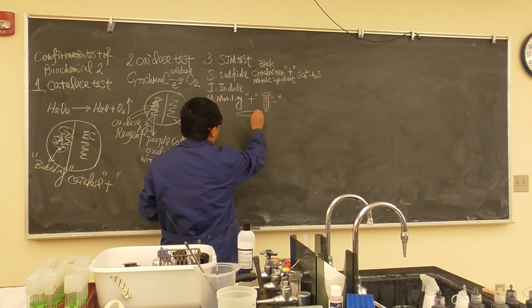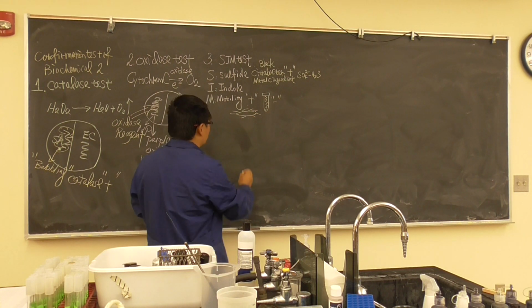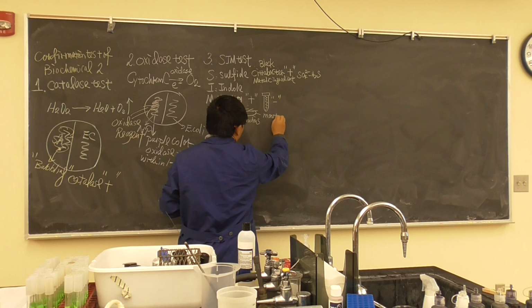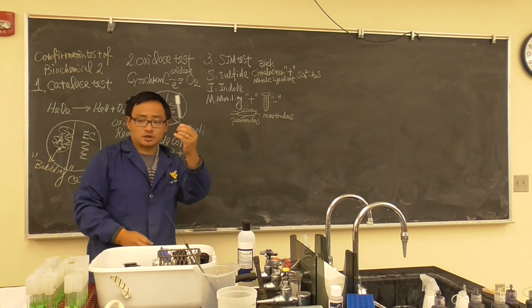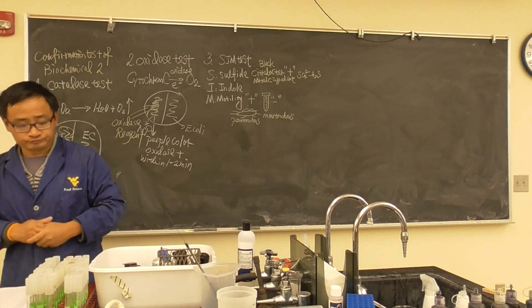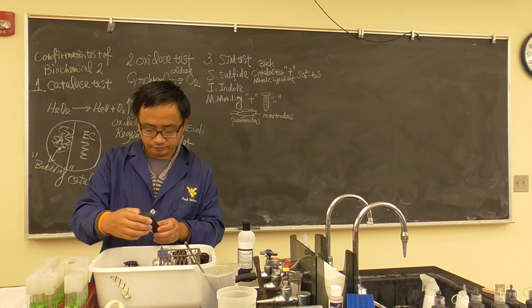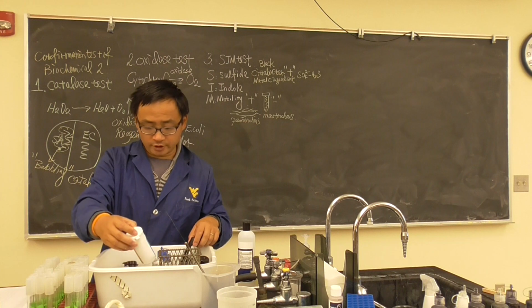Very possible. The possibility is the flagella cover the whole surface. We call it peritrichous. Peritrichous. And this is monotrichous. Okay, so we talked about the motility and sulfide. Okay, how do we test the indole? And I need to find a reagent right here. How do we test the indole? Can somebody tell me how we test the indole? Do you remember? Which reagent do we need?